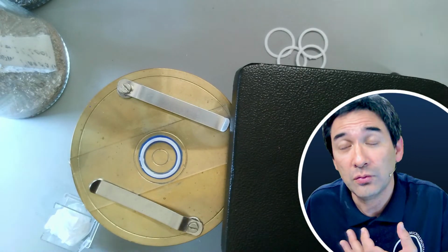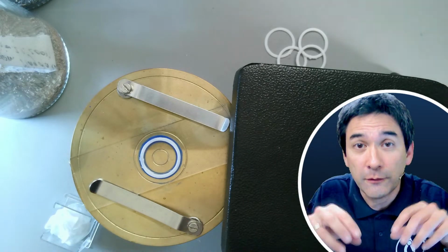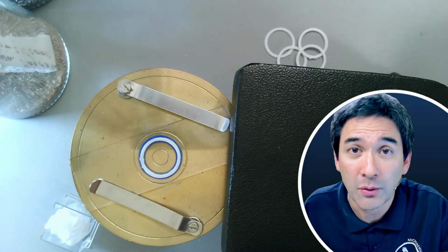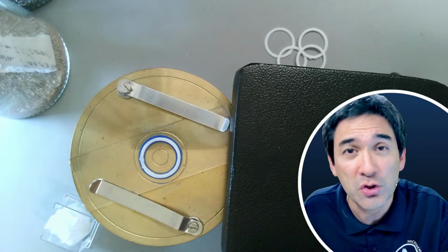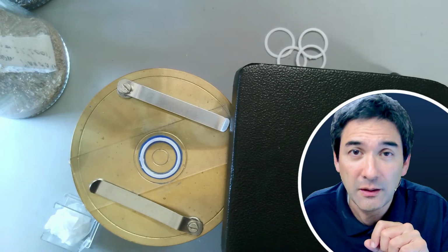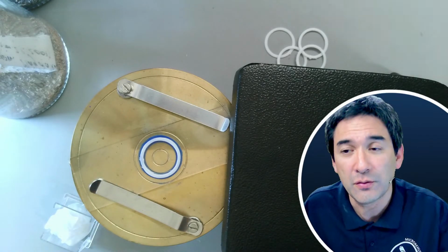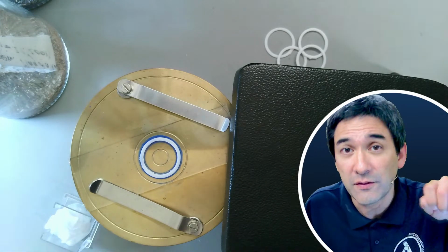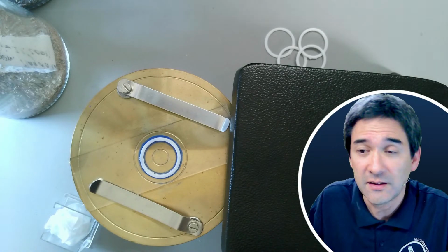And actually the real reason why I'm making those slides is because I want to use epi illumination. That means light coming from the top using a stereo microscope. So for the high power microscope objectives that have a small working distance, these slides are not suitable. And even if the distance would work, you wouldn't see a lot anyway. So it is actually designed to be used for stereo microscopes. What you can do is use the low power 4x objective and then use a flashlight from the top. I also made some videos about that, and this also works.